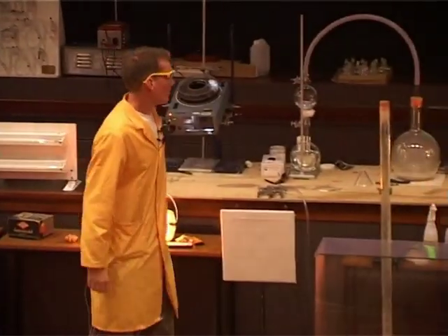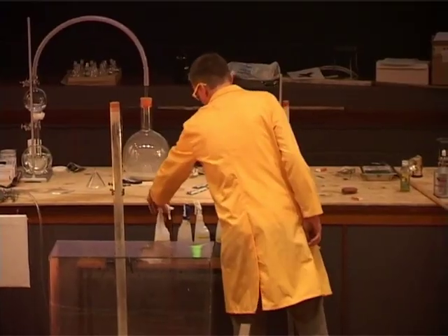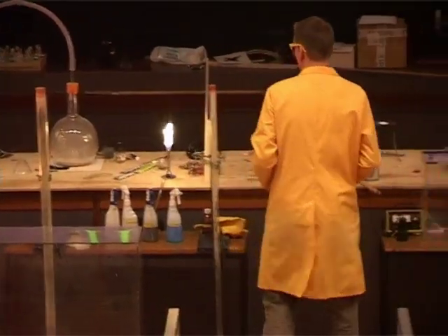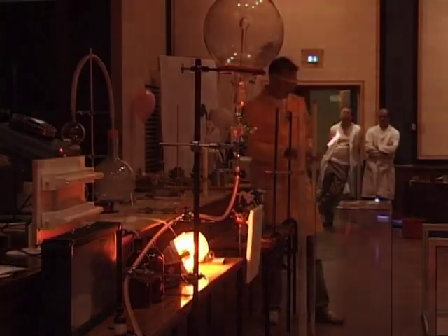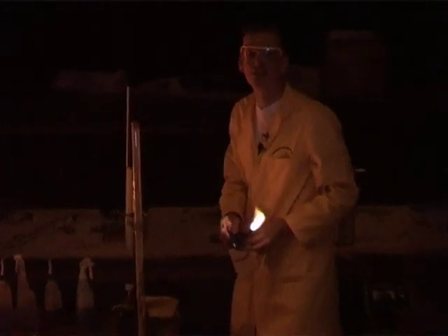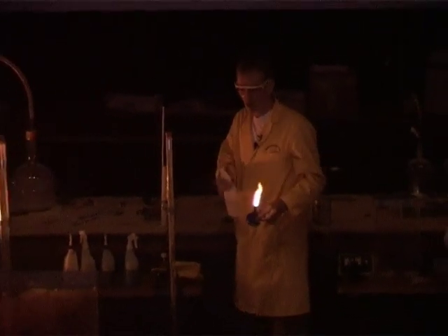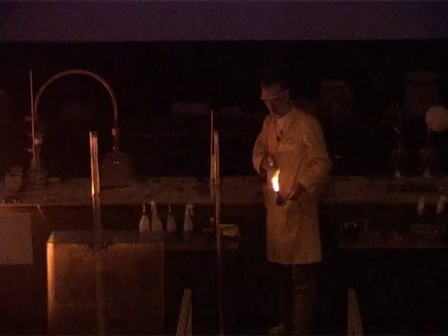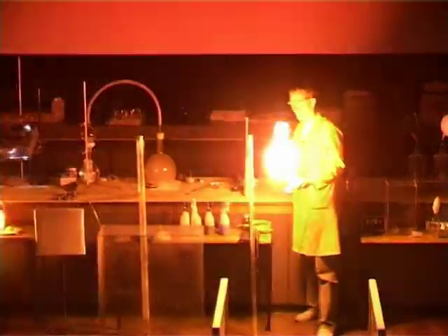Okay, well, other things that contain sodium also give out this light. So in the spray can here I have some alcohol, and I've dissolved a little bit of sodium chloride in this. This is just common salt. Okay? And as it sprays through here, we get a brilliant yellow flame, exactly the same colour as the sodium street lamp.